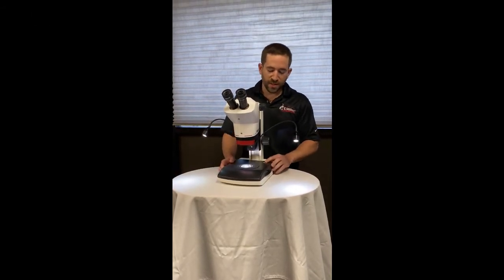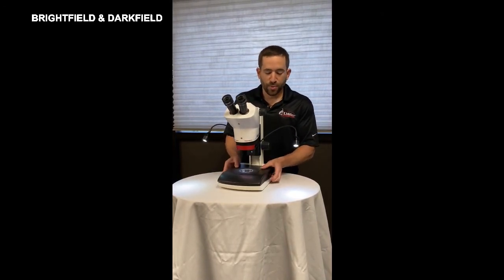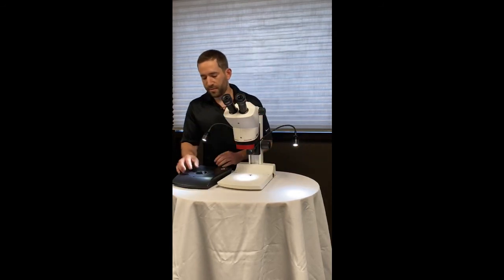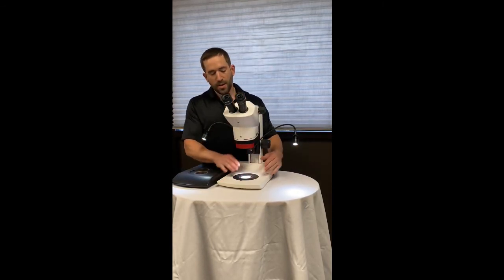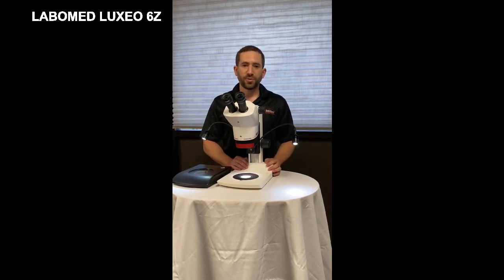The transmitted light base includes both bright-field and dark-field illumination and can be removed if you do not need it. This high-quality stereo microscope is affordable and a great choice for your laboratory.